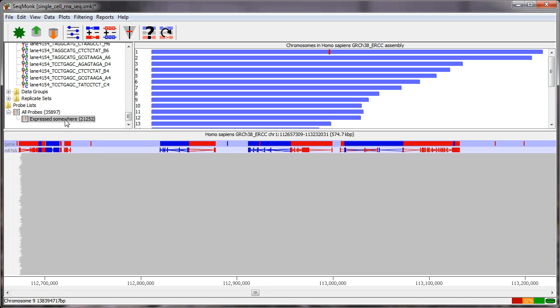In this data set, I don't have predefined groups of cells. It's all just one set of cells, and I want to see if there's any structure that I can spot from the data. And an easy way to get to that is, rather than looking at all of the genes, to look at genes which are unusually variable, and therefore where the variability might reflect a difference in expression rather than just natural variability in a homogeneous population.